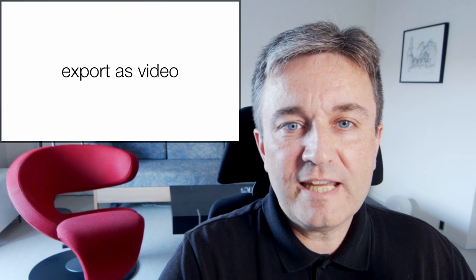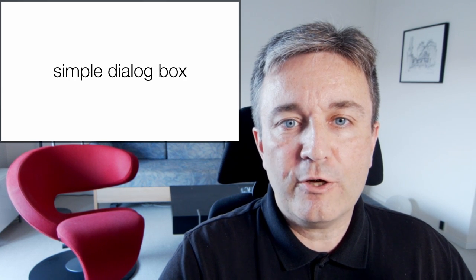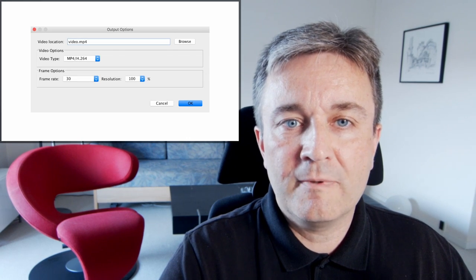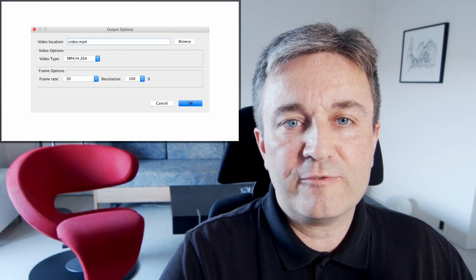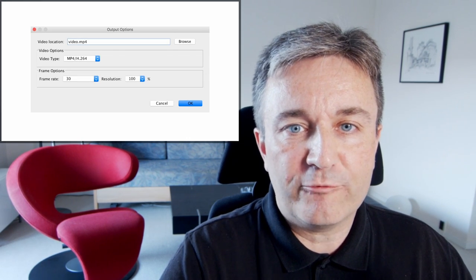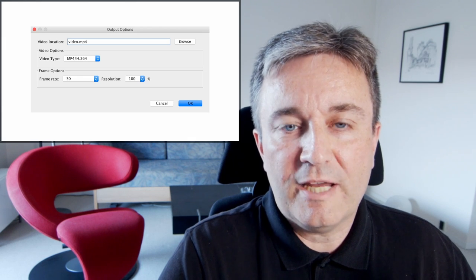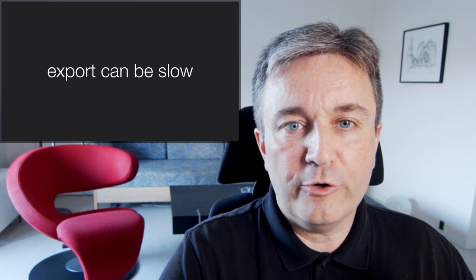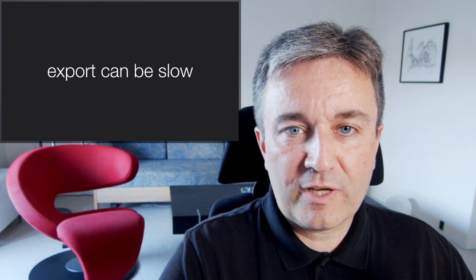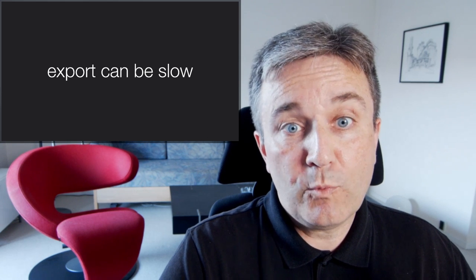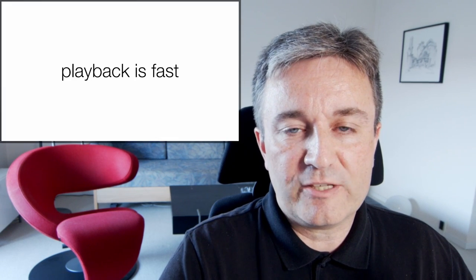You can take the result and export it as a video using a simple dialog box that looks like this. You simply specify the file name, the file format, the frame rate, and the resolution, and you export it. I should warn you, though, that export can be rather slow. But once it's exported, playback is fast.